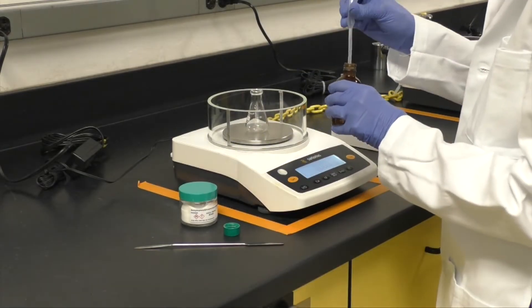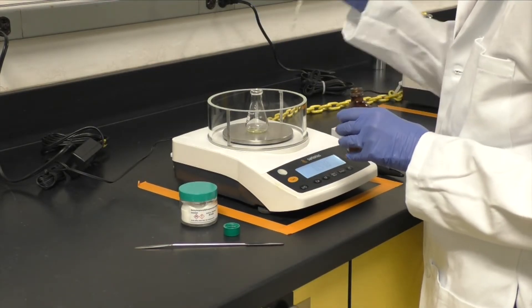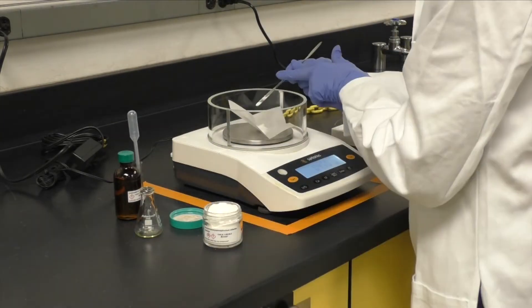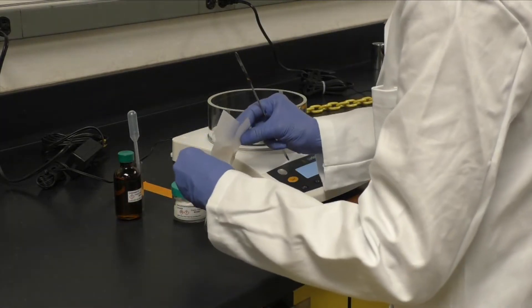Weigh out 500 milligrams of your assigned aldehyde into a 25 milliliter Erlenmeyer flask. Then weigh out and add 500 milligrams of benzyl triphenyl phosphonium chloride.